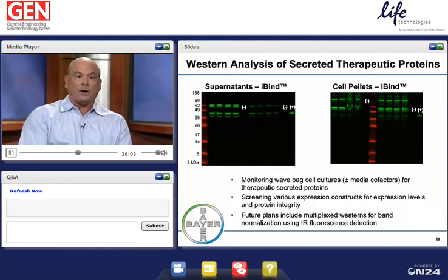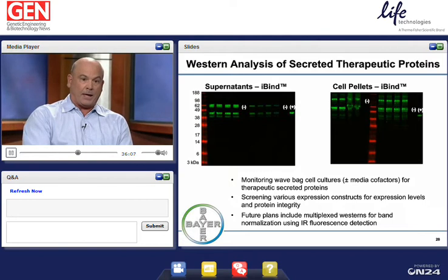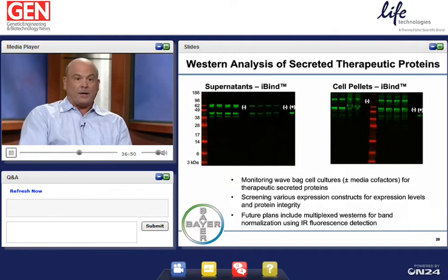And this is actually a blot where the researchers were looking at adding different forms of vitamin K to the cells during the transfection. Originally, when we started out, before we added vitamin K, we got absolutely nothing secreted in the supernatant. So all the protein was held up in the cell pellet. By adjusting with this additive, we're able to start to get a secreted protein. The group of four on the left on the supernatant blot show protein with vitamin K, and on the right, the next group of four on the supernatants is without any vitamin K. So you can see there's a significant improvement there.